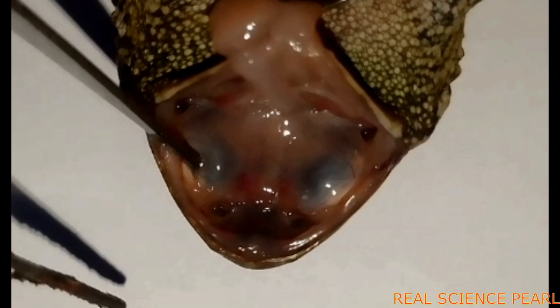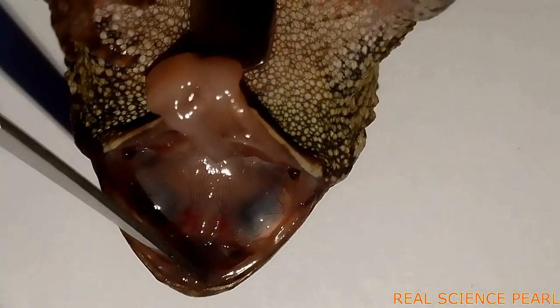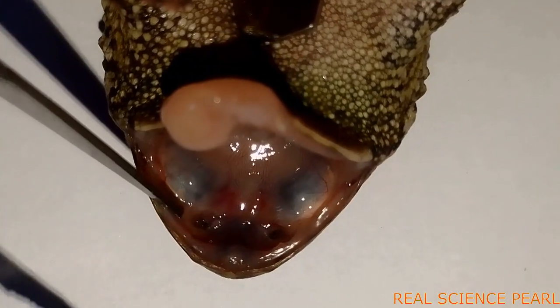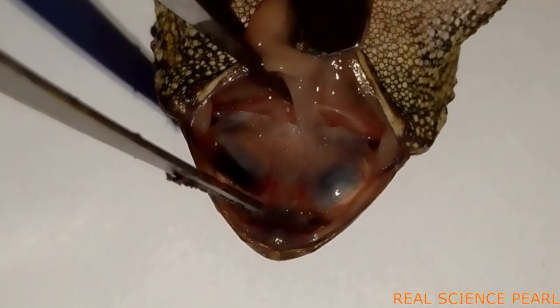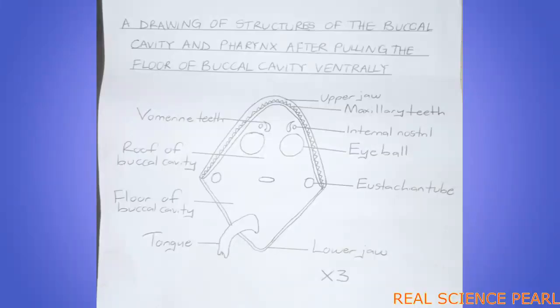We may be required to draw the structures of the buccal cavity after pulling out the tongue. Be careful — they can tell you to cut along the left side so that you display the ventral roof of the buccal cavity, with the lower jaw to the right. This is a different drawing from when you have just opened it. I am going to show both cases: when we cut and when we don't cut.